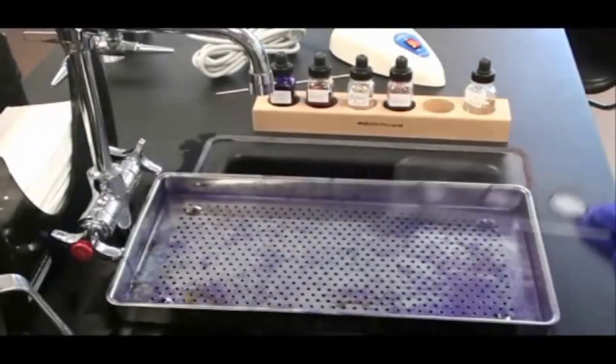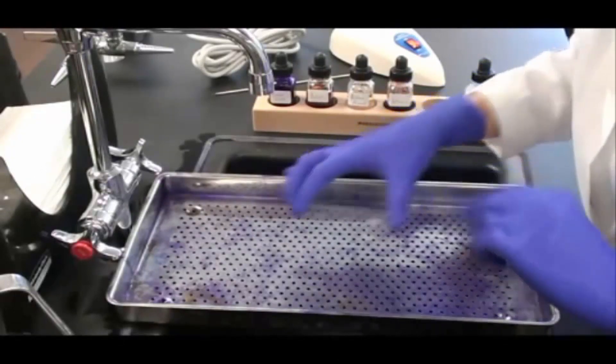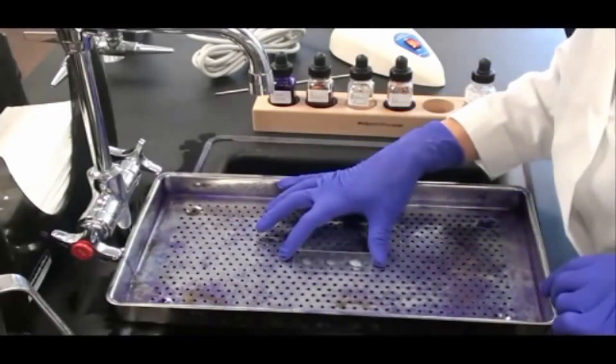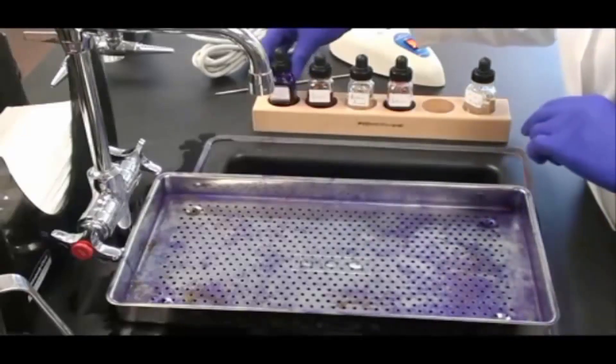So I start with a bacterial smear. My slide has been prepared with a Gram-positive control on the left, a Gram-negative control on the right, and my unknown bacteria in the center.